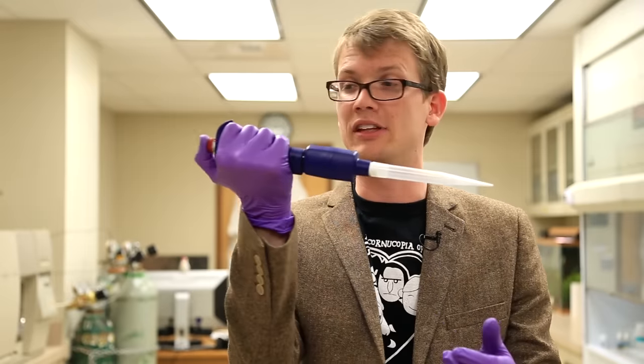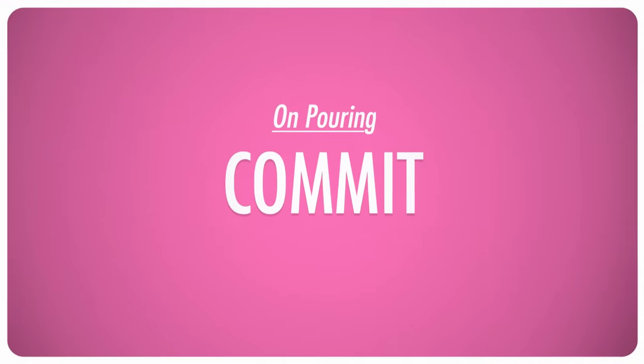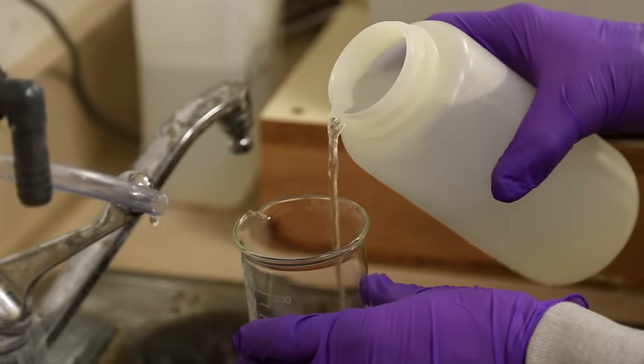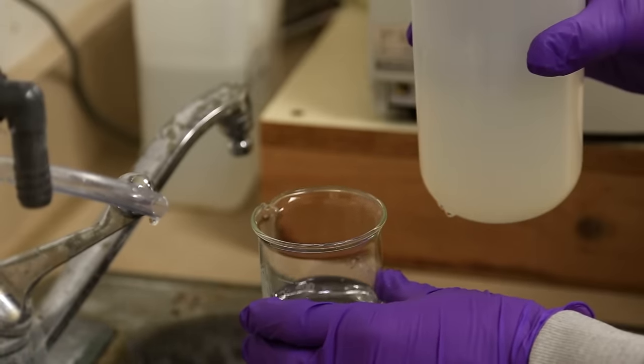You put that on the end there, and then you go on, and you draw the liquid up with this thing. That's what that's for. Also, these days, most pipetting is done by these guys, which are way cooler anyway. Pipetting is one way to move a substance from one container to another, and it's a pretty good one. But if you want to pour, you can pour. But let me just give you a tip. Commit. We tend to get all nervous when pouring stuff in the chemistry lab and go all slow with it, but that's terrible. You won't overcome the surface tension, and it'll dribble down the side of the container, so just commit at the beginning and at the end. Destroy that surface tension.